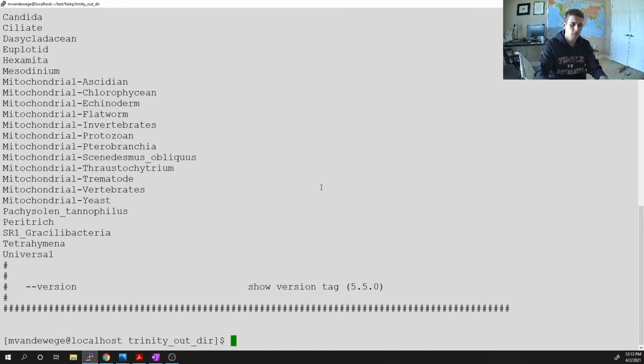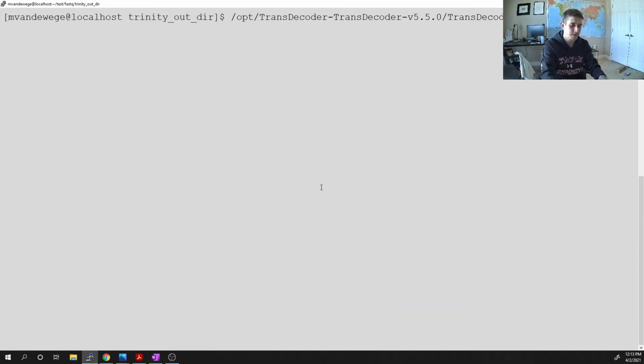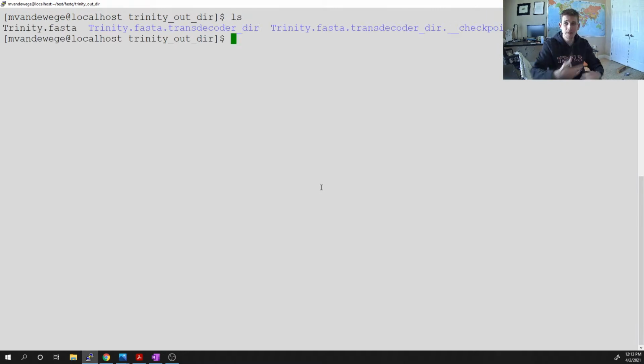So if I'm running this program, again, for real, all I'm doing is calling the long ORFs, -t, and then trinity.fasta. That's all it takes. And again, this takes about 10 minutes to run, so I'm not going to run it. And I don't want my stuff to get overwritten. But nonetheless, it will produce a couple of directories. A transdecoder dir, and then a checkpoint longest. And I think the checkpoint's there in case your job gets interrupted. You can restart it, and it will start from where it left off, not all the way from the beginning.